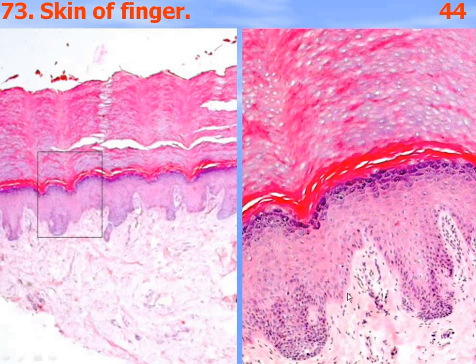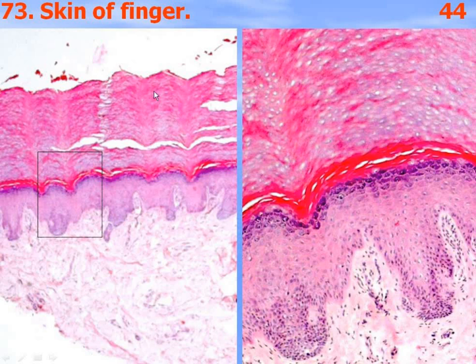First, the basal layer located at the basal membrane. Second, stratum spinosum. Third, stratum granulosum — contains in the cytoplasm small basophilic granules. Fourth, stratum lucidum — it's usually a bright pink layer with no cells visible. Fifth, stratum corneum, which consists of many layers of squamous cells.